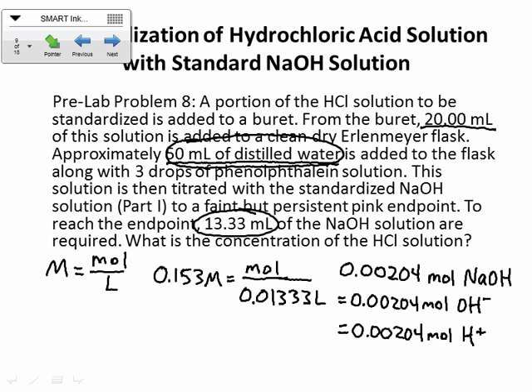Yeah, this one's kind of tricky, but there's a good reason for this. The main reason is we're going to conserve NaOH that way. Because if you dilute it, then it takes less of the NaOH to reach that equivalence point, right? You only have to add 13.33 milliliters. If we hadn't diluted it, we might have had to add 20 or 30 milliliters, okay? So this just makes it a little bit quicker to get to the endpoint. So again, another good thing to keep in mind for your procedure, but do what you want, okay?